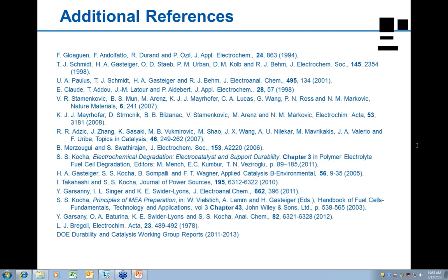Shaman, do you have any other comments on this? No, I have seen this problem in presentations with non-precious metal catalysts. I don't do a lot of it, but the limiting currents are all over the place. And in the case of non-precious metal catalysts too, a separate protocol is necessary, and we haven't reached that point.